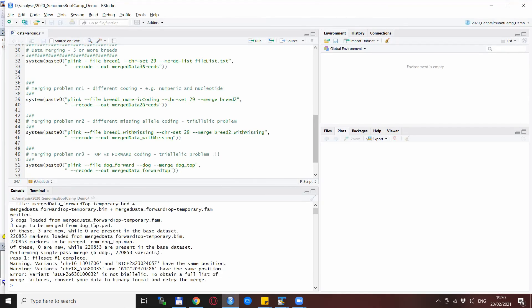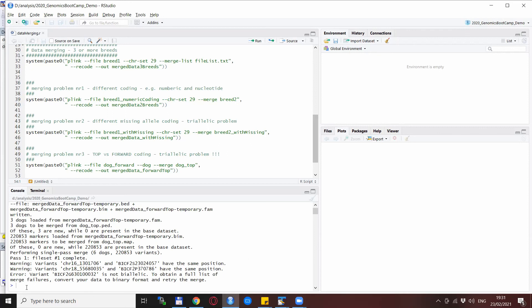So this is the output for the merging or for the attempt for the merging. You see that there were three dogs each and quite a lot of markers. We have some warning messages that are unrelated to our problem, but the error message again appears with the now familiar message that one of the variants, probably the first one it encountered, is not bi-allelic.